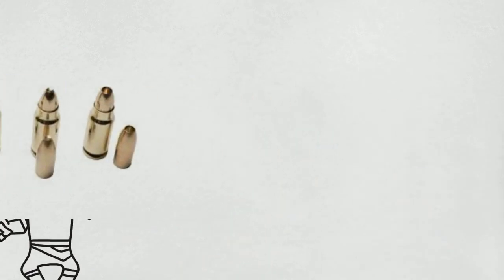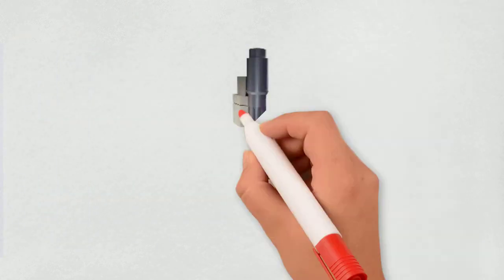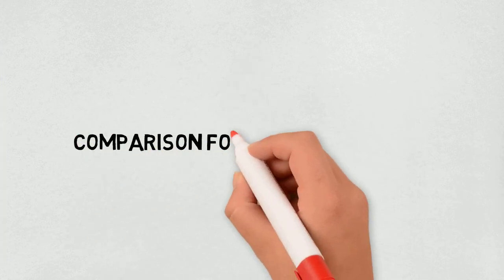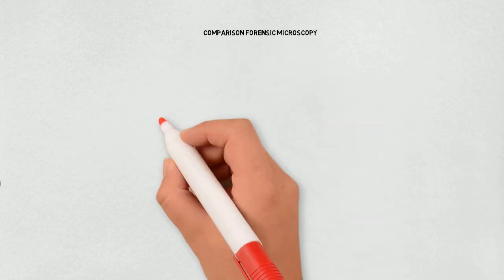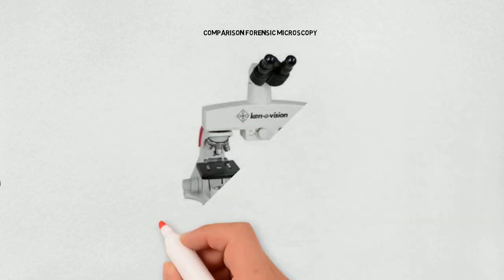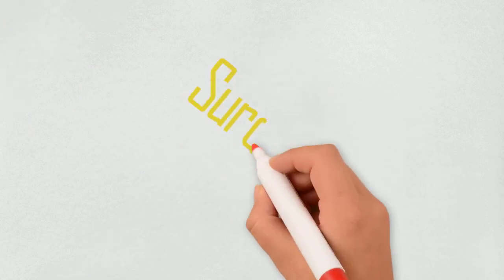Tools employed in forensic microscopy vary from basic low-power hand magnifiers to high-power electron microscopes. The primary tool is used in comparing two objects side by side to determine whether they came from the same source. There is a link between possible suspects and the crime scene. It is also called the forensic comparison microscope.